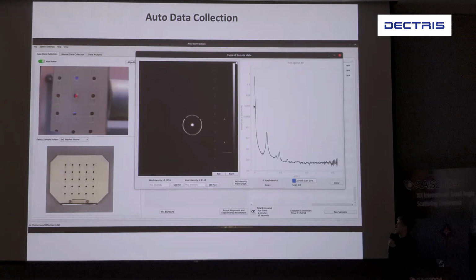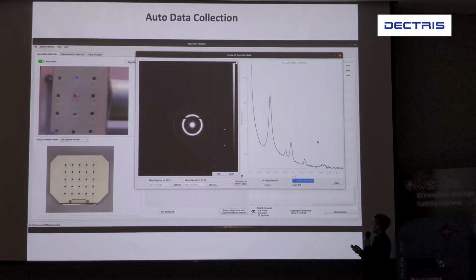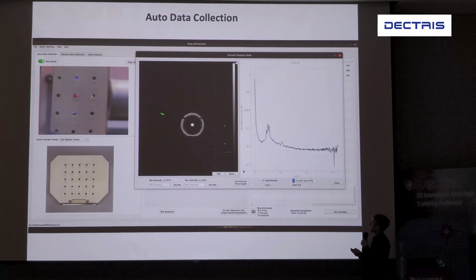Yeah, so you can see that this is real-time data. This one's a hexagonal. These are block copolymers, diblock copolymers. And this one's clearly in the hex phase, and then I'm gonna let it go to the A15 just so you can see a cubic sample because it looks a little bit better. Yeah, but basic functionality, able to zoom in, change the intensity, but yeah, here you go.